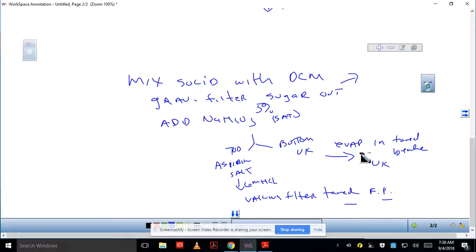And that's really the principles. One of the things I might ask you on a quiz is by what principle will we separate things tonight? Well, we're going to separate everything based upon solubility in different solvents. We'll also use acid-base reactions, but in reality, everything's going to be separated based on solubility. We will use an acid-base reaction to convert something back and forth between something that is soluble and something that is insoluble.